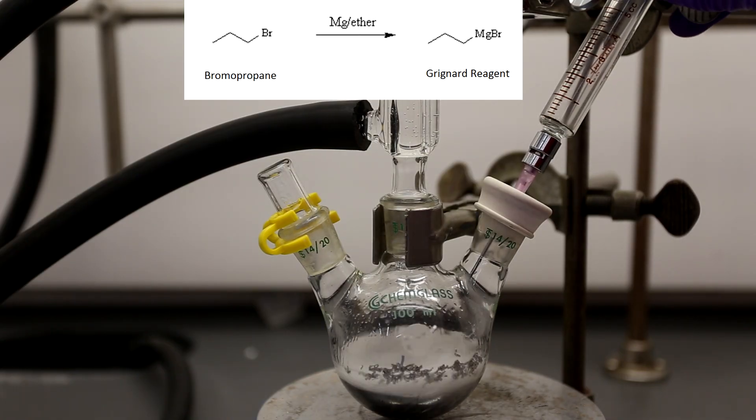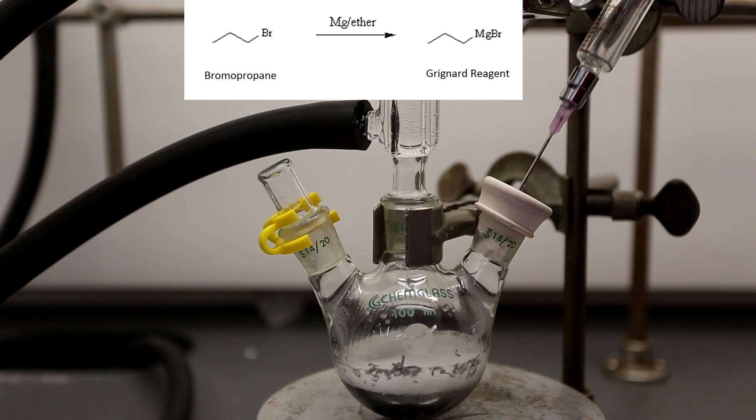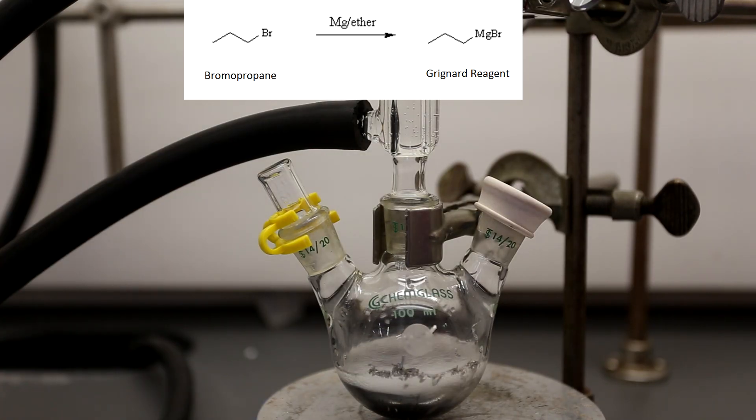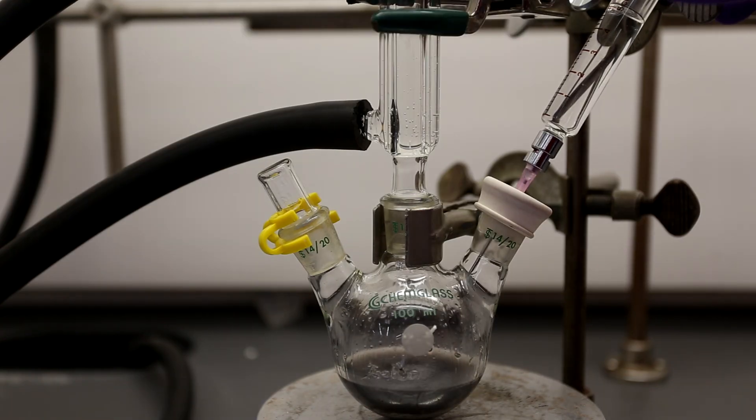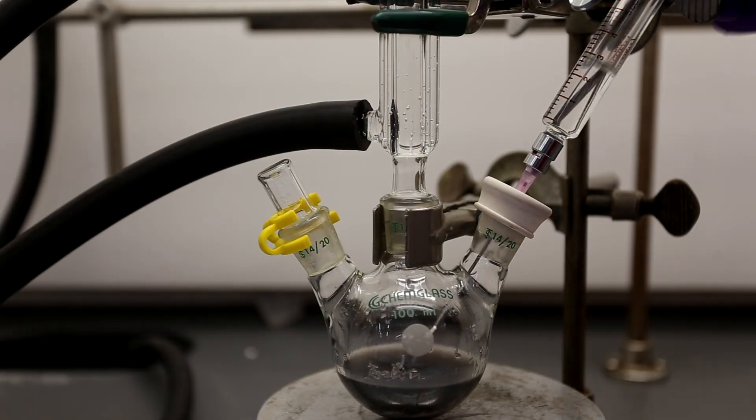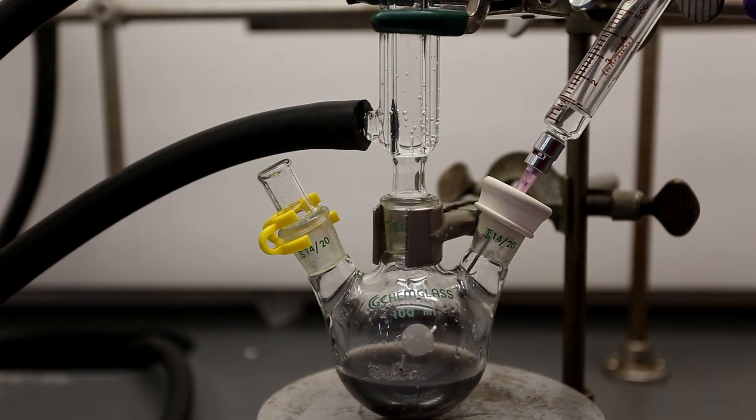The reaction between the bromopropane and the magnesium is shown above. The bromopropane reacts with the magnesium to form the Grignard reagent. This reaction is very exothermic, so it causes the ether to boil, and that's why it's very important to have a condenser column.